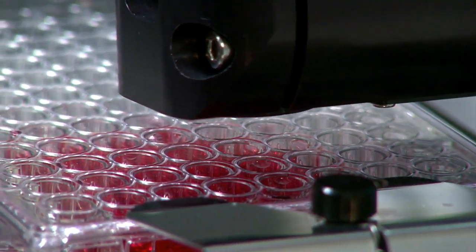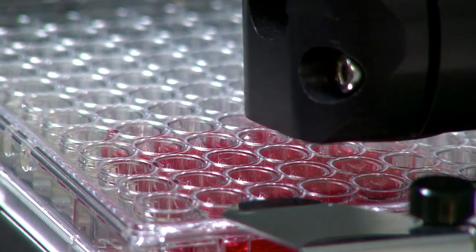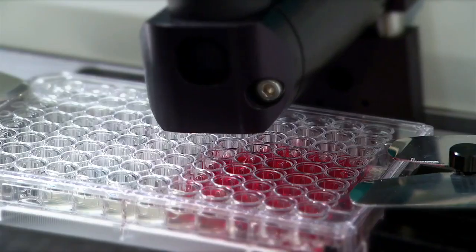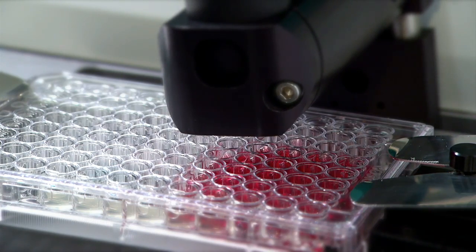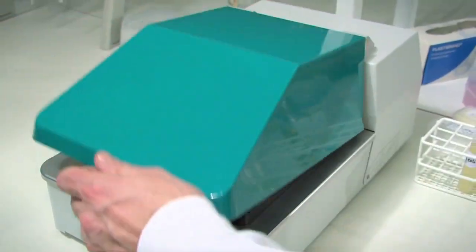oCelloScope's unique scanning technology, combined with advanced software, means that condensation, crystals and inhomogeneous samples can be taken into account. These are factors that traditional plate readers cannot compensate for, making oCelloScope an indispensable instrument for any analysis in which fast and effective responses are vital.